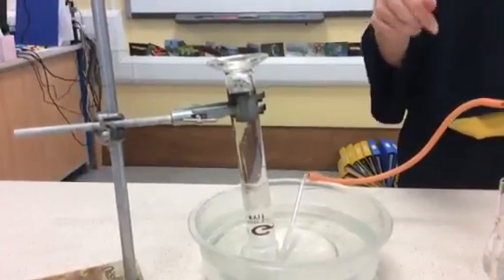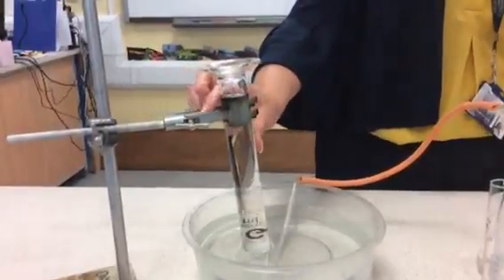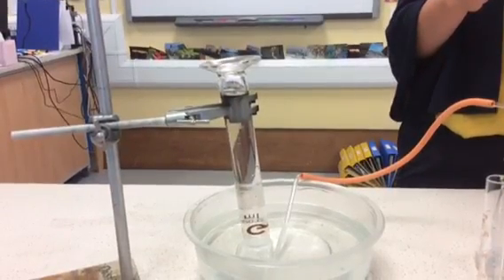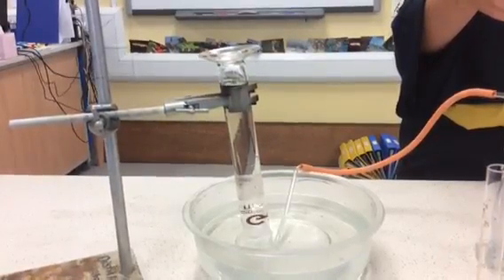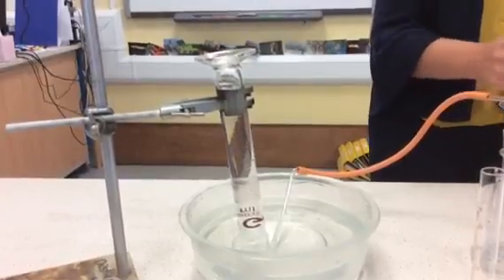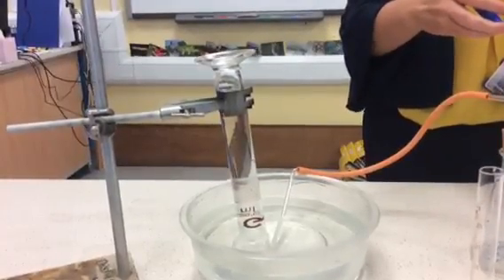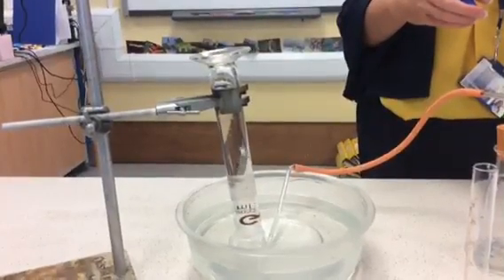Whilst you're waiting for this, write down a word equation, so zinc plus sulfuric acid. Write down the name of the salt that's forming, and also make sure that you're writing down the name of the gas that's being produced as well. In our next 30 seconds we are now on 12 cubic centimetres. Okay, so we're now going for our next 30 seconds, and see what we get.